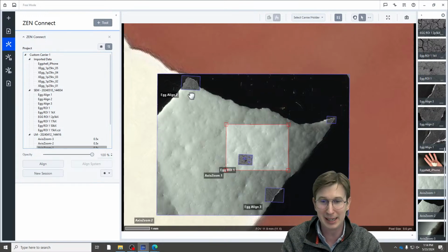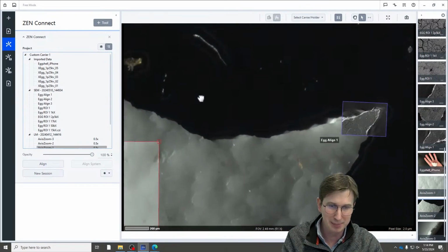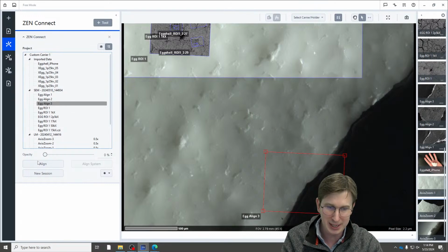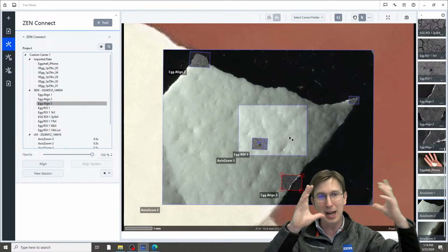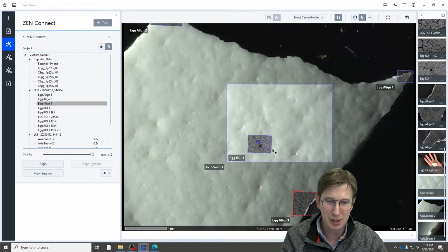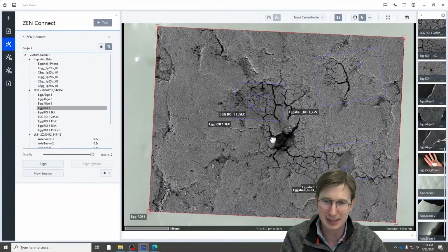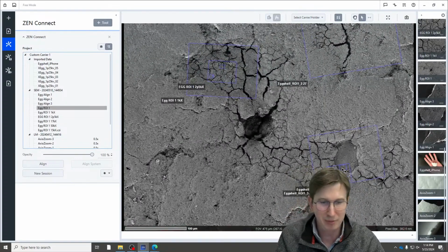And so the points I use for correlation, we see these SEM images from the tip, then this other part over here on an edge, and then this final edge. Features that are obvious between the two. Once I have those 3 points, I can align the optical data to where I'm at on my SEM, and then use that optical information to navigate and start collecting. And then I proceed as I would doing standard SEM operation, where I'm finding and navigating.